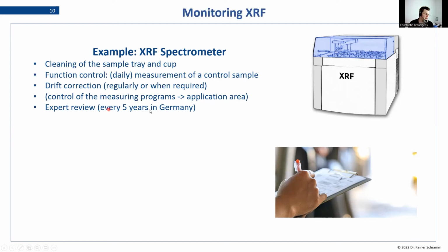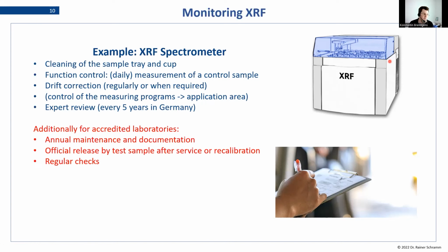And another thing is that here in Germany there is this rule: we are actually only allowed by, I think, it's the federal government law, we are only allowed to operate this machine if we have an expert here on site, and that expert needs to be reviewed every 5 years. So before we can actually turn this on, we have somebody of the operators used as a responsible person, and he has to redo his expertise every now and then. Otherwise, we are not allowed to operate these machines. Of course, these regulations vary from country to country.